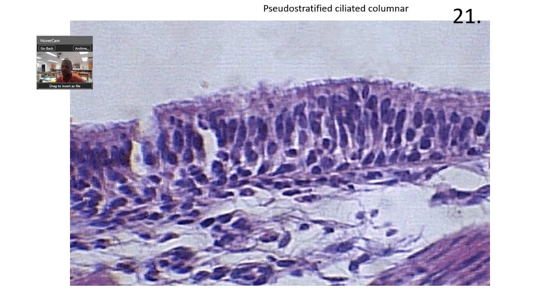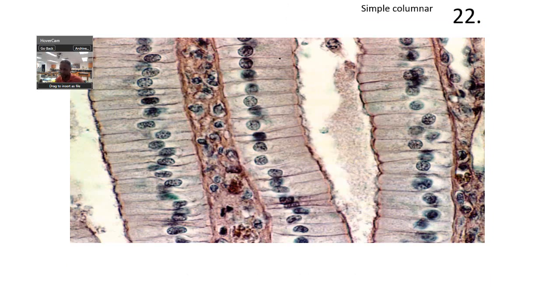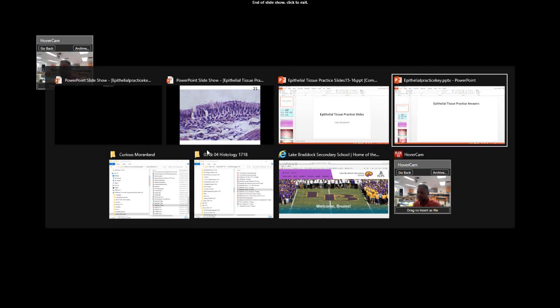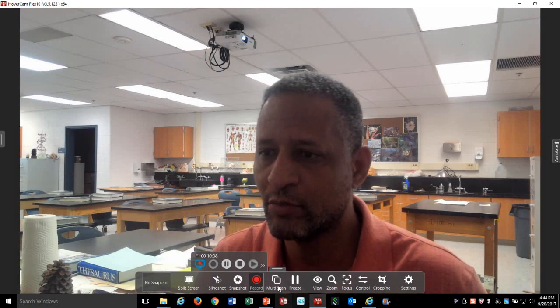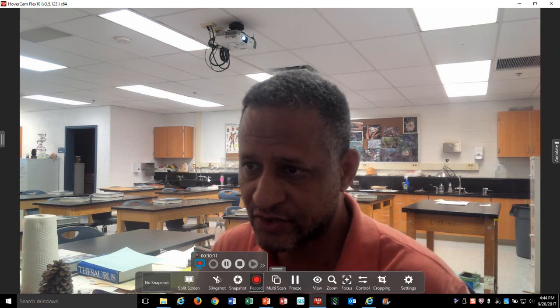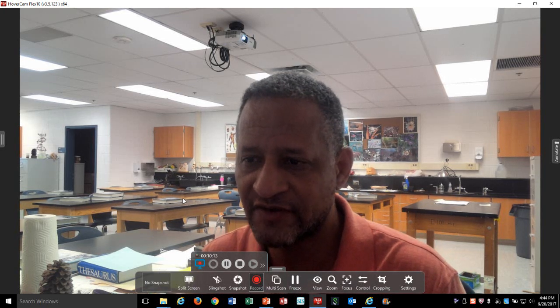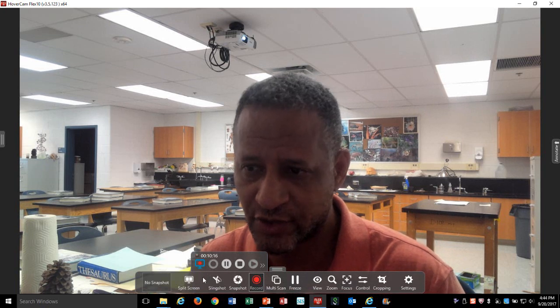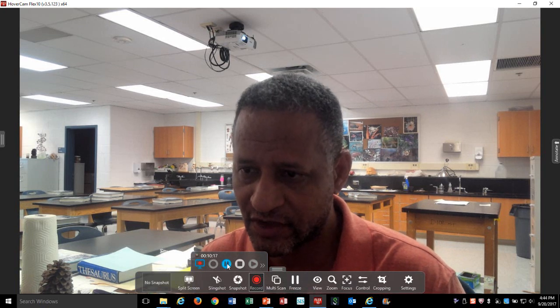I'm going to switch to another PowerPoint in a second. Let's just look at another example — simple columnar. And that kind of ends that section. This has been a good review. I'm going to do just four or five slides. This time I'm just going to give you my answer choice. Are you ready for the speed round?